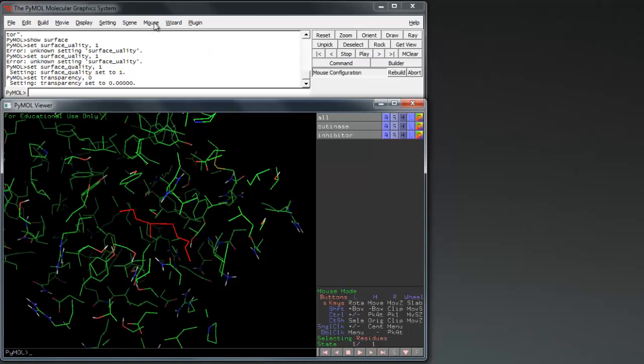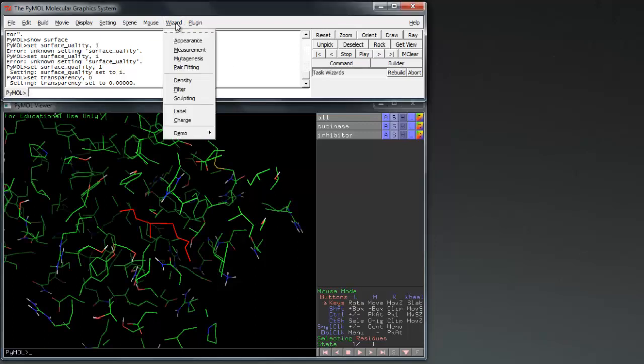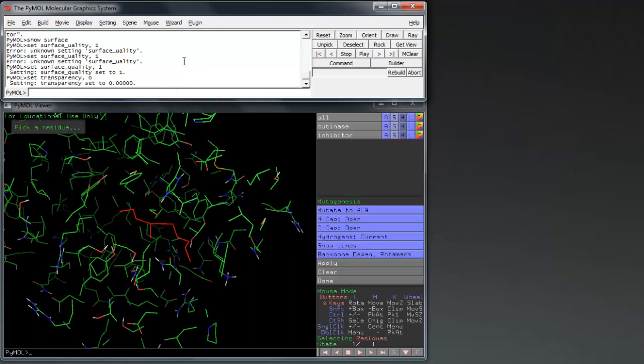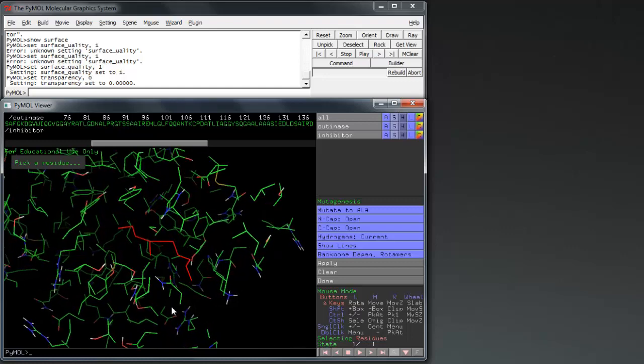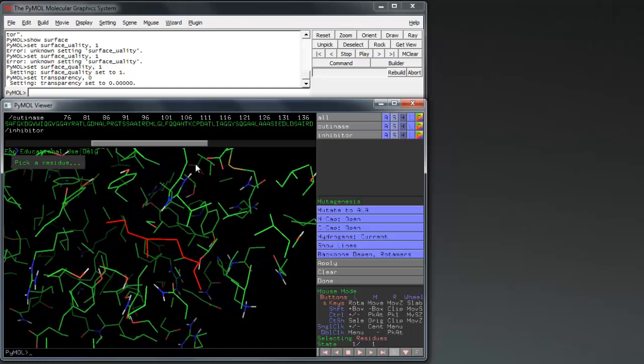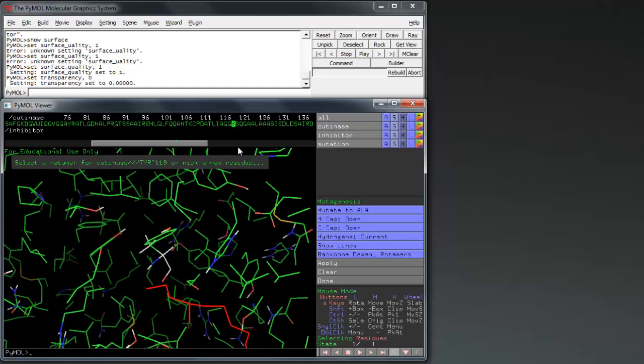Go to wizard, mutagenesis to open the mutation interface. Show the amino acids by pressing S at the bottom right hand of the screen. We want to mutate the large tyrosine to a smaller alanine. Select the tyrosine at the active site.